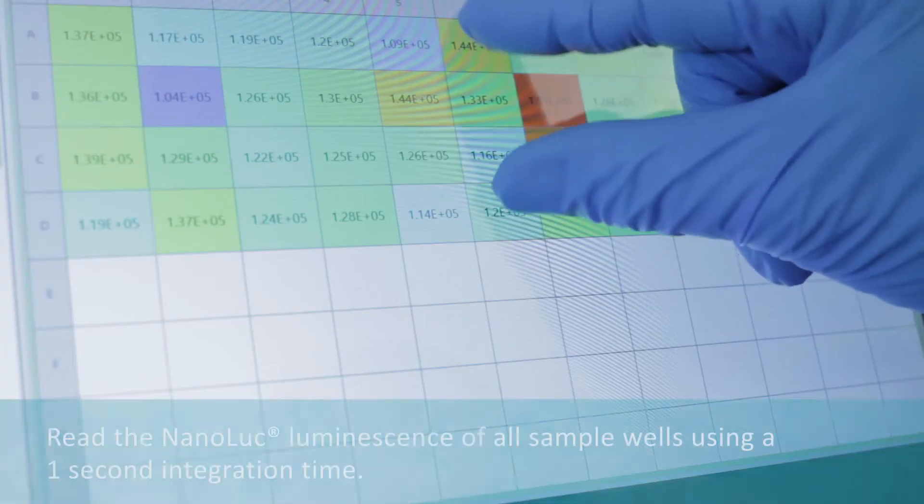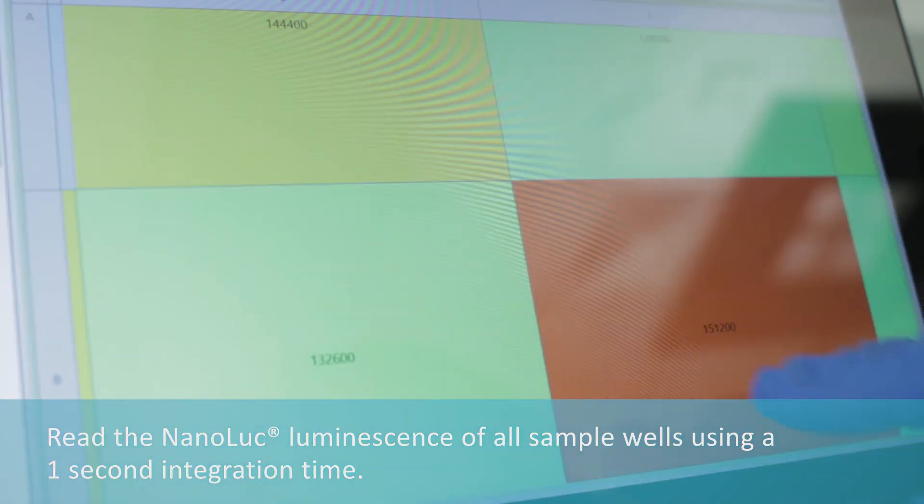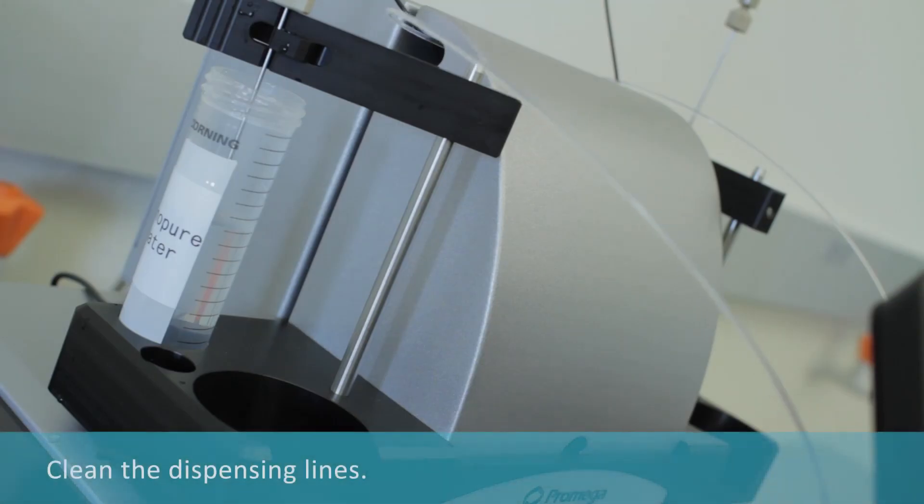Inject all sample wells with 80 microliters of Nano DLR Stop-and-Glow reagent from injector number two and incubate for five minutes. Read the NanoLuc luminescence of all sample wells using a one-second integration time, then clean the dispensing lines.